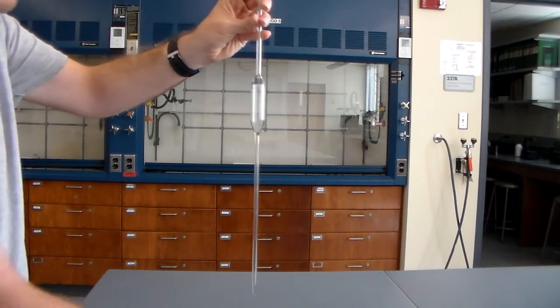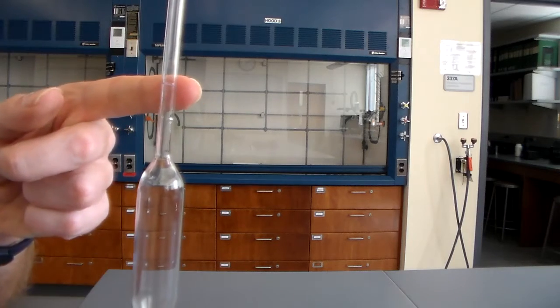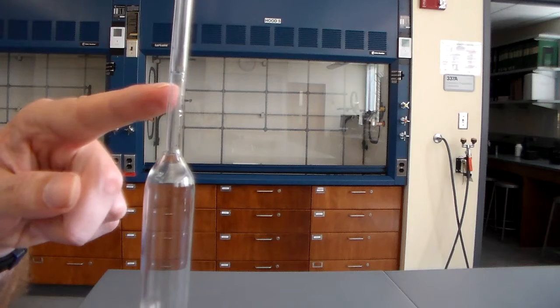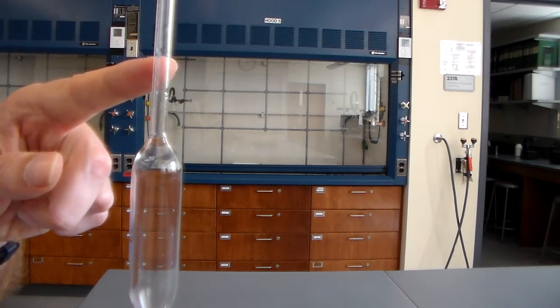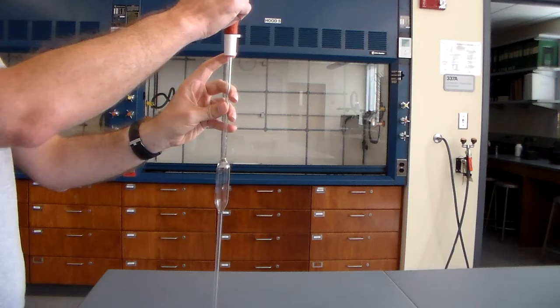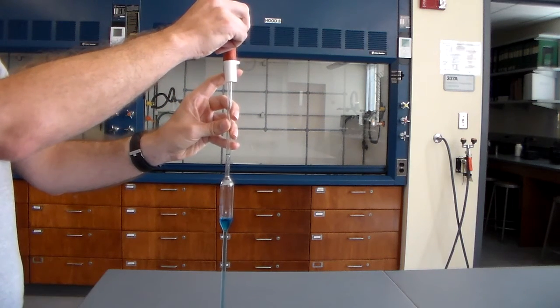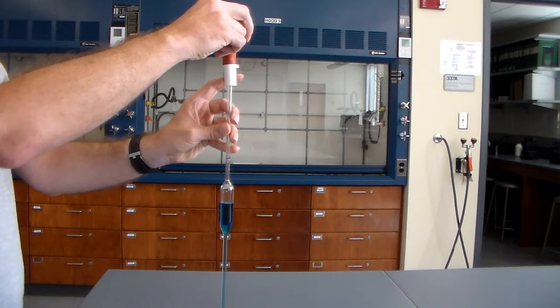Now, once all that is done, we're ready to get our solution. All right, now that we've rinsed it, we're ready to fill it up. And what we notice is that there is a line right about here, and this is the line that we want to fill up to. So we want the bottom of the meniscus to match up to where this line actually is. So again, making sure you have one hand secured on your pipette, press out your bulb, and then start sucking your liquid. This may take 2 or 3 times, depending upon how successful you are.